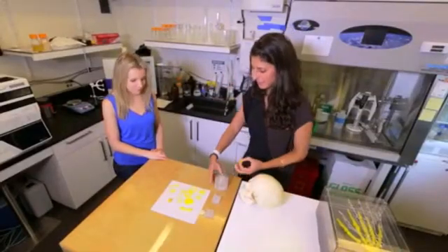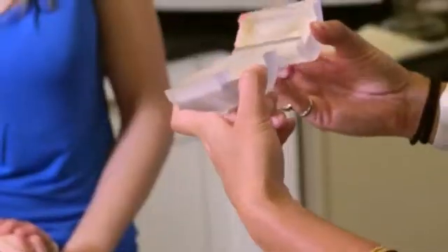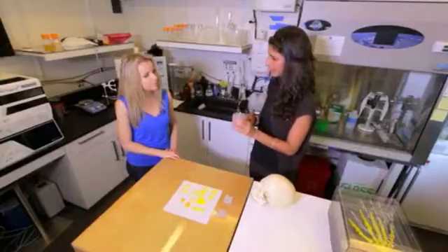Where we come in is we say, okay, how do we get the cells to live inside here? And that's not a trivial process. So we engineer a system that goes around it, this bioreactor essentially, and you can see that there's space for a scaffold to live inside it. Each bioreactor that we engineer is perfectly matched to each of these different shapes, right? So we cultivate the bone inside of here with cells and deliver the growth factors and the environmental conditioning that these cells need to then turn those materials into bone.